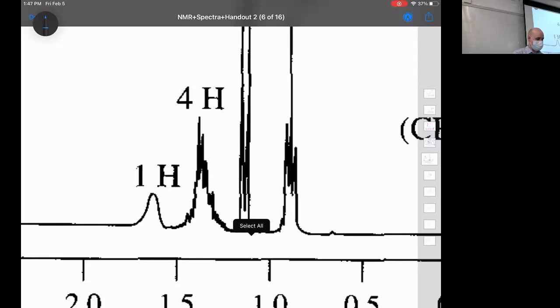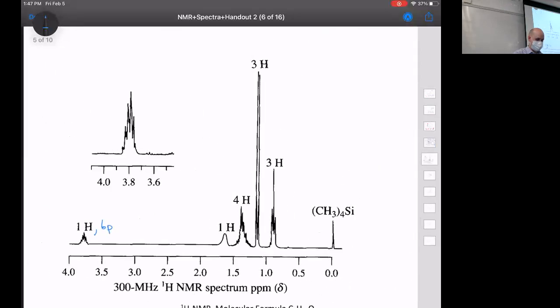So what you have to do is build the rest of this molecule and figure it out by deduction. I will tell you that this is 2 different CH2s. But save those for the end, because you can't start from those since you don't know what their splitting is, because it's a mess.